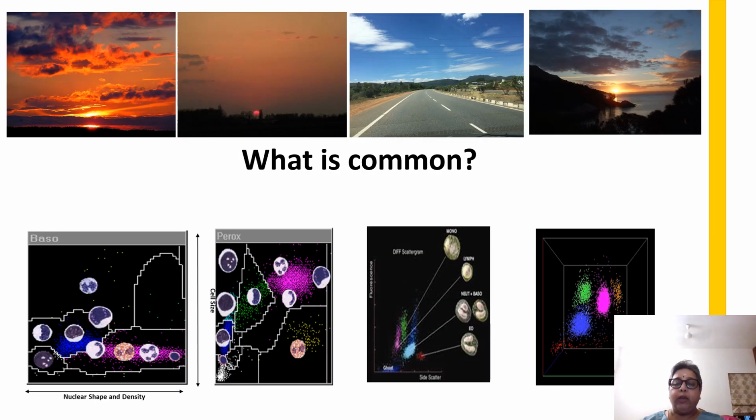So this requires a little bit of understanding of physics, which I shall try to do in as simple a manner as possible. But before we start, let us look at these beautiful sceneries that are a part of what we see every day. The lovely orange sunset, the twilight, the blue sky. What does this have in common with these scatters that we see on our machine?